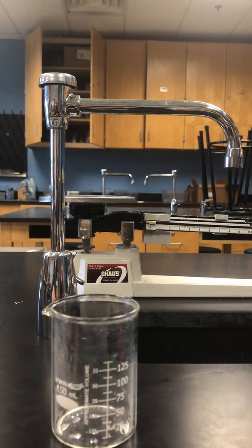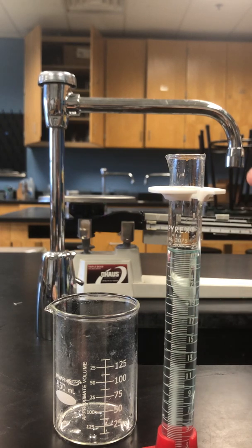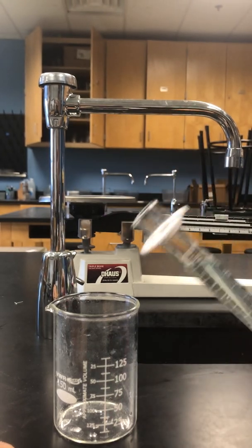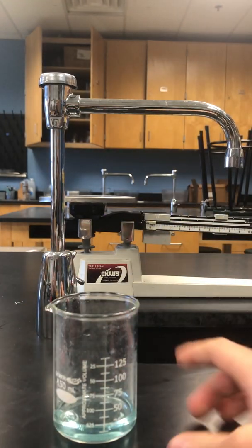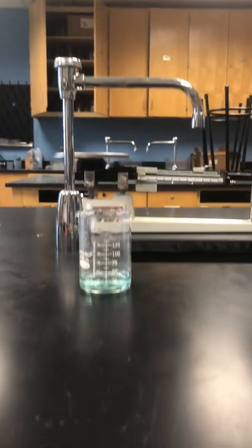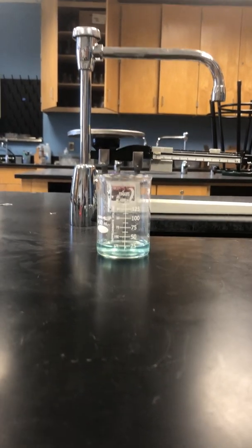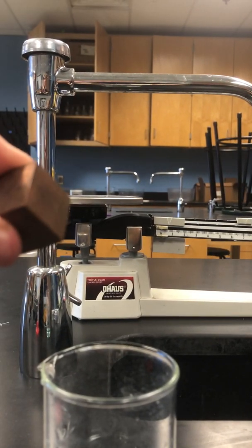And if I pour that water into the beaker, how many milliliters of water should I have? If I've got 25 mils in my graduated cylinder, how many mils should I have in my beaker? Let's find out. Well, would you look at that? It's about 25 mils. It didn't really get bigger or larger. I'll try and get it so that you're at eye level. But see, the water level's right at that 25 point. So the volume of water didn't change, just like solids.